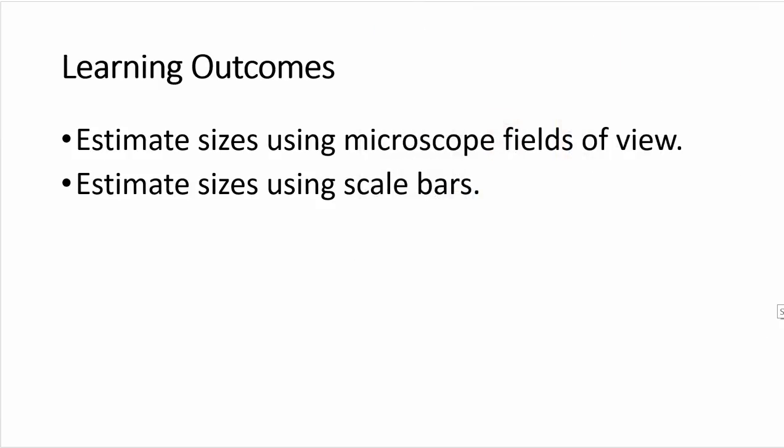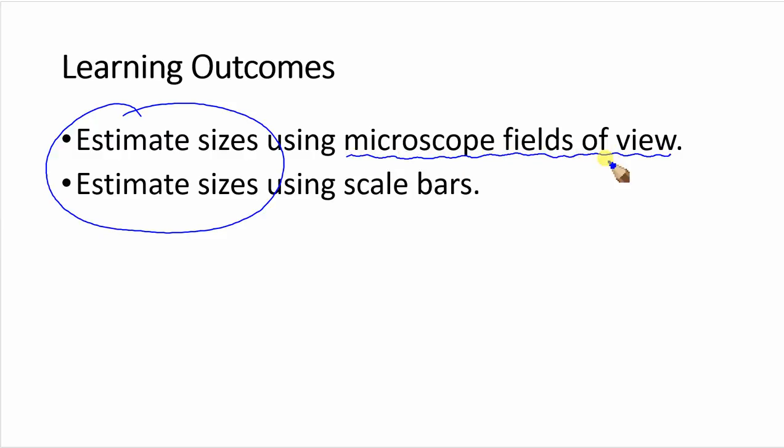In this lesson we've got two learning outcomes. We're going to be estimating sizes, and there's two approaches to estimating sizes. We can use the microscope field of view, and we can also use scale bars.